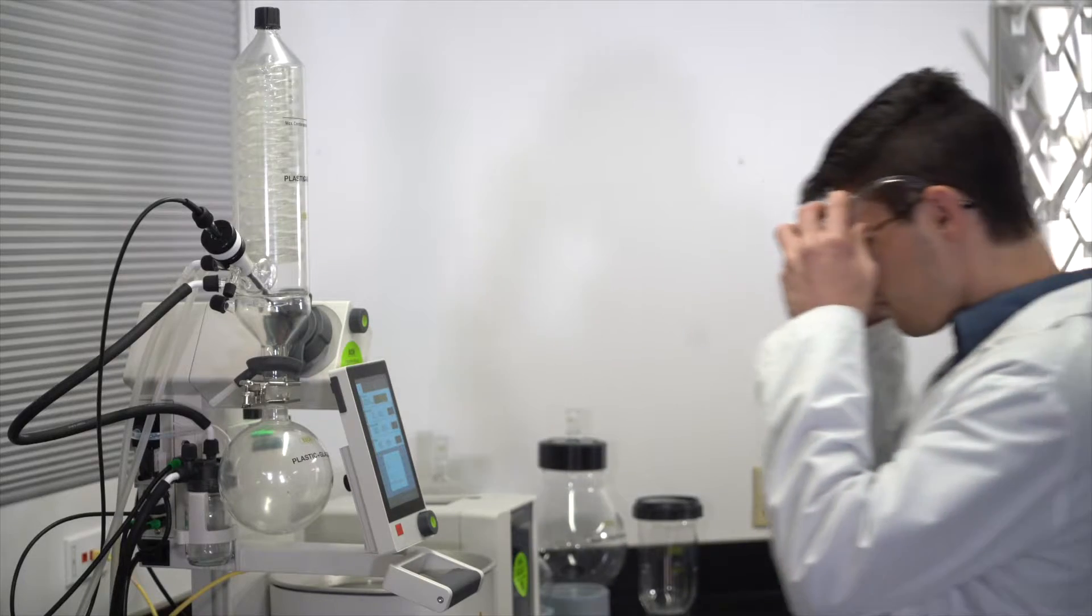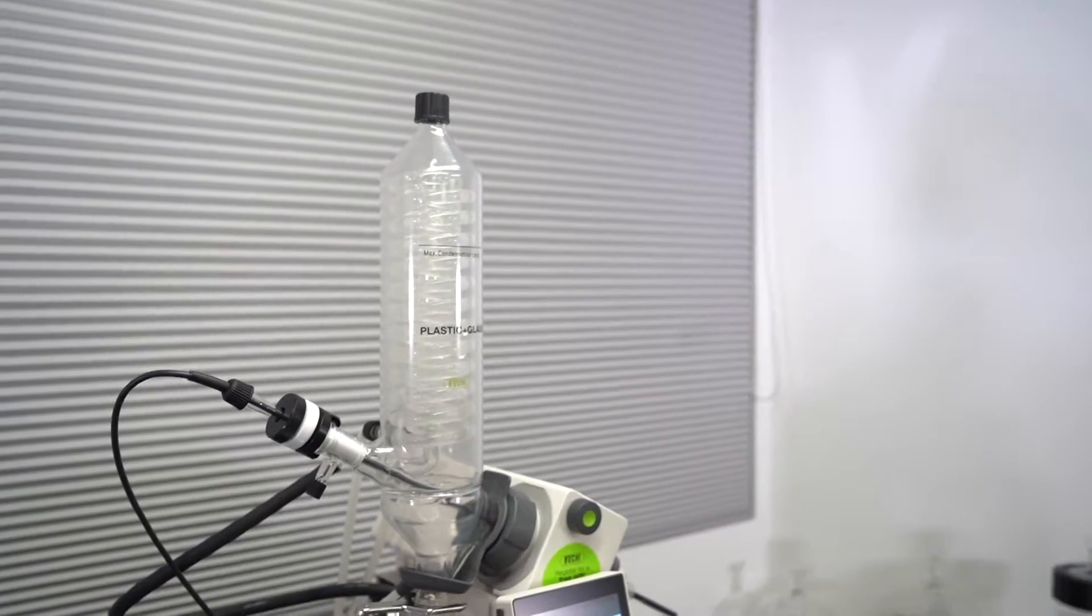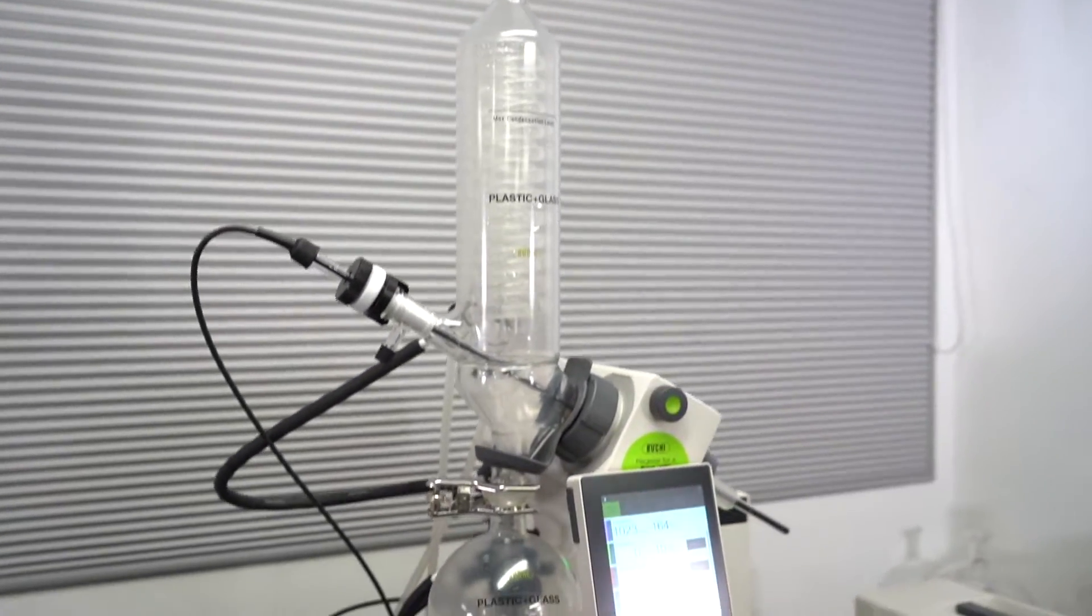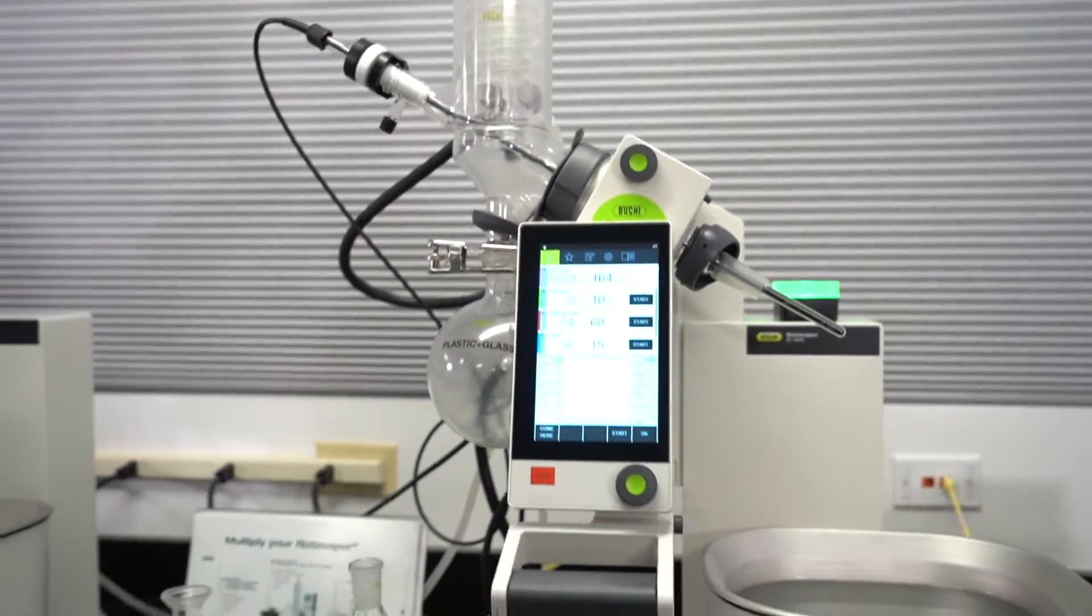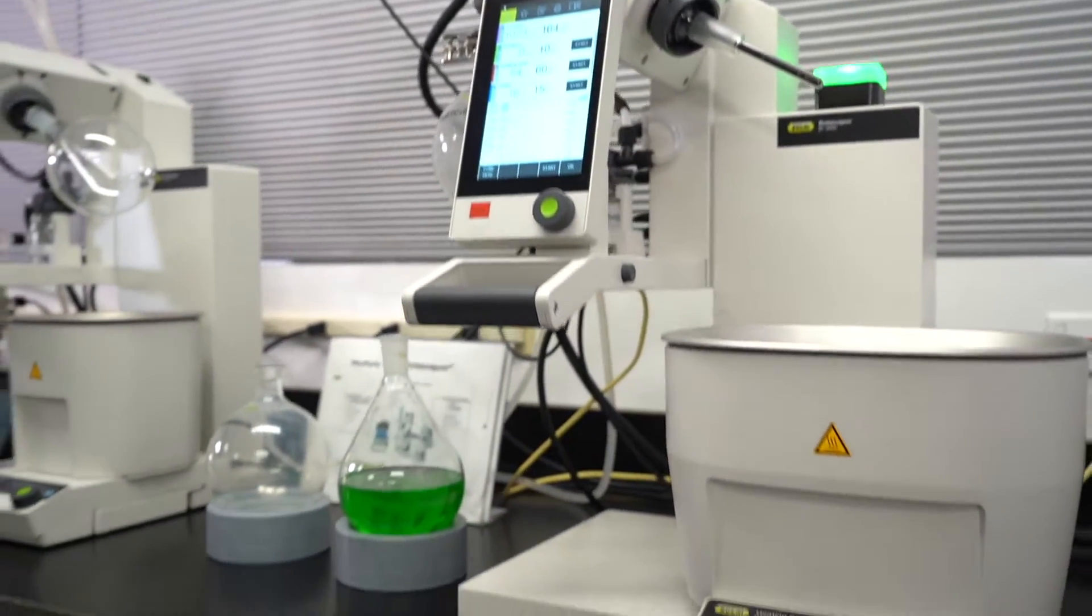Now let me show you our R300. This is our flagship model, which boasts all of the features that define a rotavapor, as well as some advanced features which set the R300 above other models.